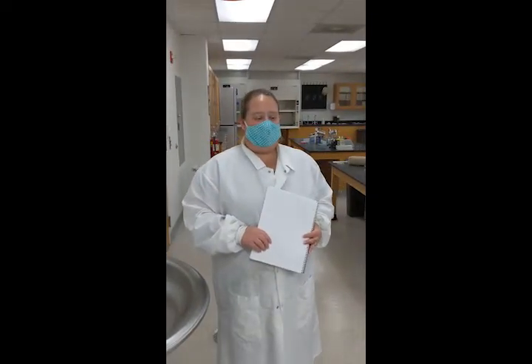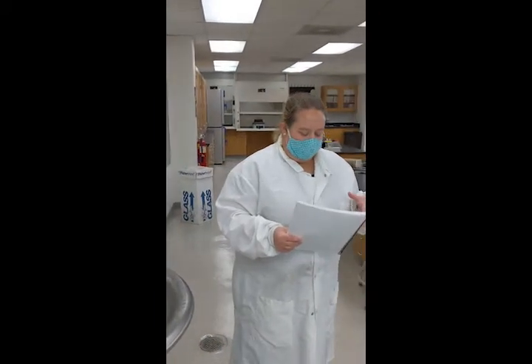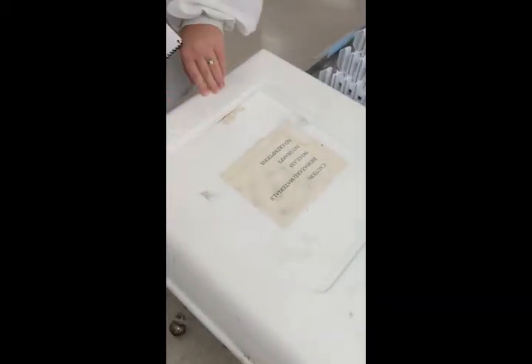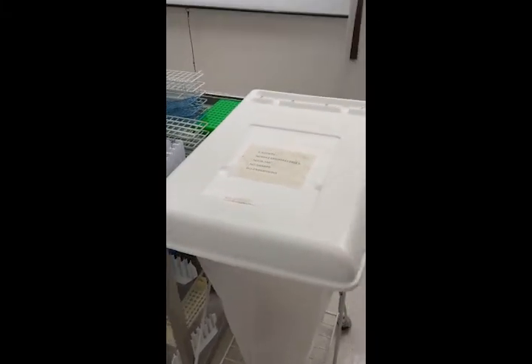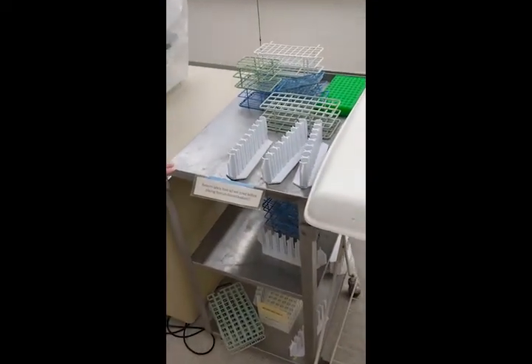In this class, we are going to be working with a lot of different bacterial cultures. Our cultures are going to be either in a test tube or on a petri plate. Whenever you are done working with your cultures, they should be discarded in a biohazard bag. This is our biohazard container — any petri plate will go in there, and swabs used for our microbes in the environment experiment also go into this container. Test tubes are going to go into baskets or racks that are sitting on this cart.